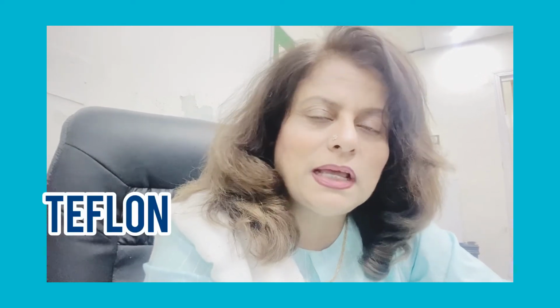And there are many other types of stirring rods, right? There are many other types of stirring glass rods. And besides glass, there are also other types, that is Teflon rods, that are Teflon stirring rods. I have selected this topic for my students because mostly in the lab I've seen that students are holding spatulas, metallic spatulas, and of course we can use a steel body, a metal body for stirring purposes also.